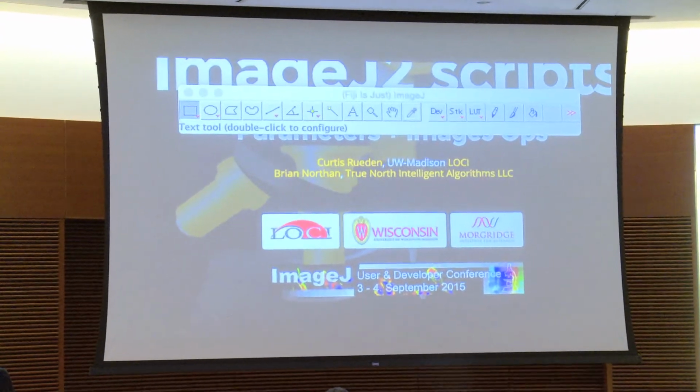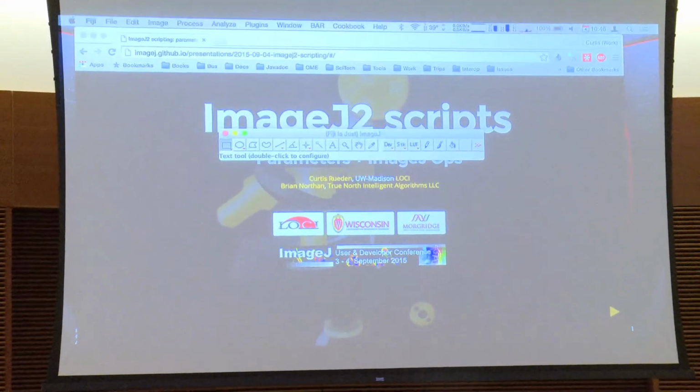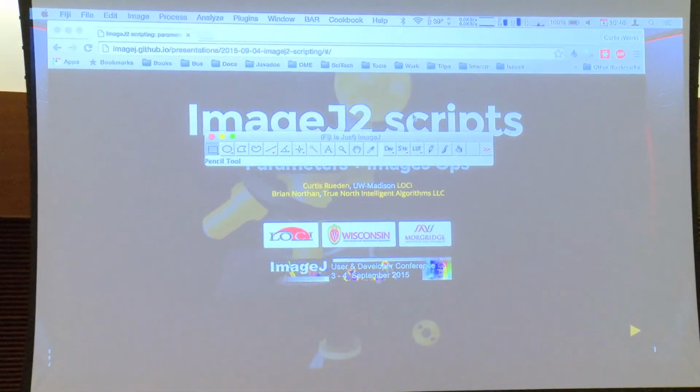Let's see what I need to update. Oh, it's on my other screen. Big warp, that's what I got. Yes.